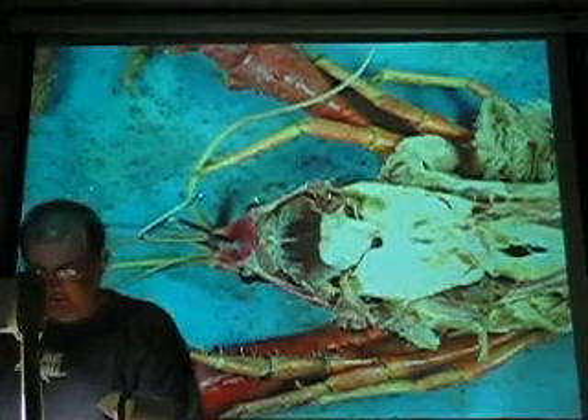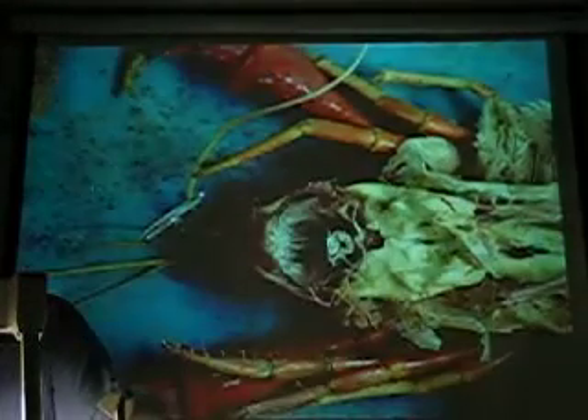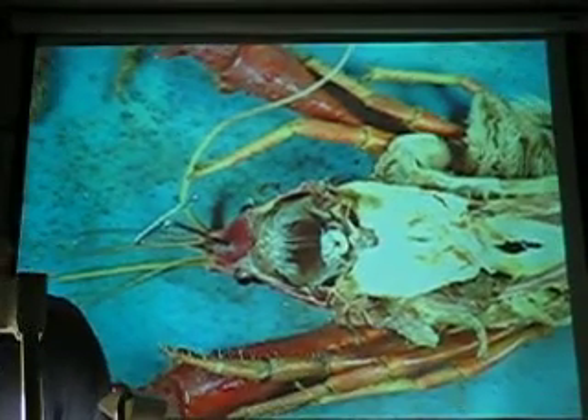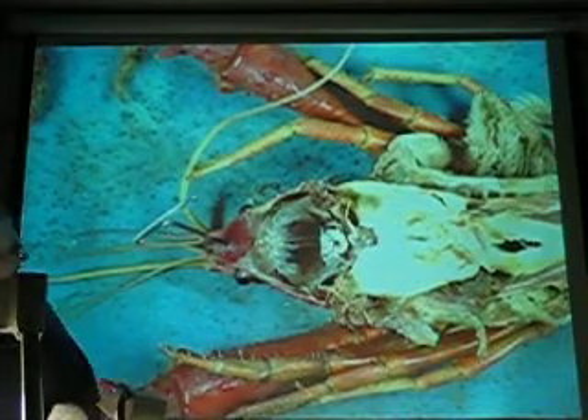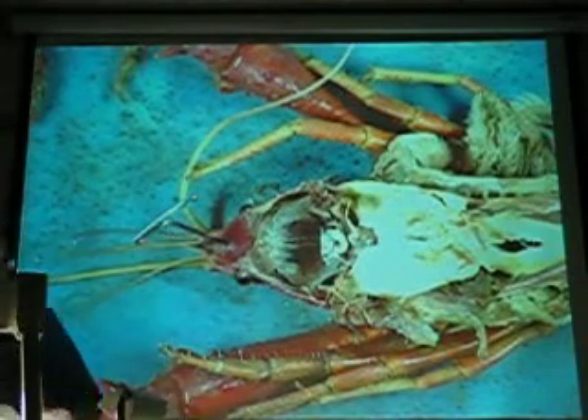Whoever did this must have been tilted. Or not. Didn't want that anymore. Hey, that's cool, huh? Look at these guys. Nerve cords? Yeah, those are nerve cords.